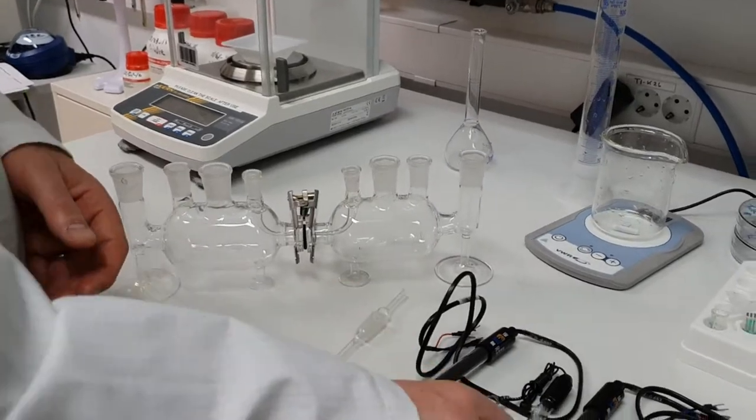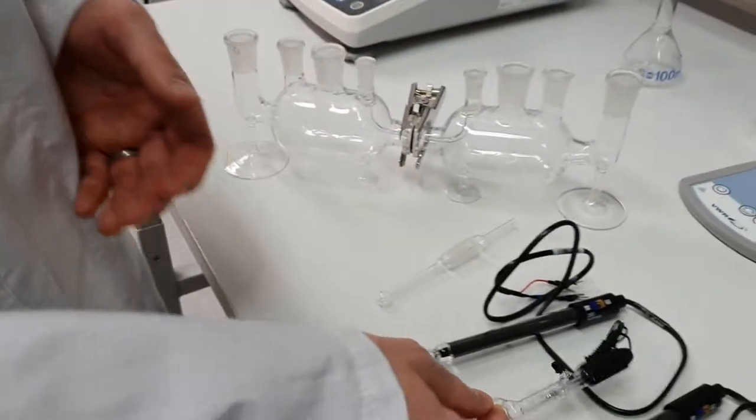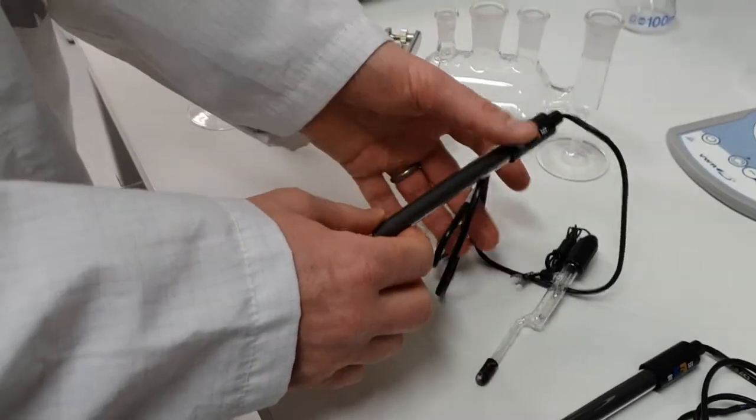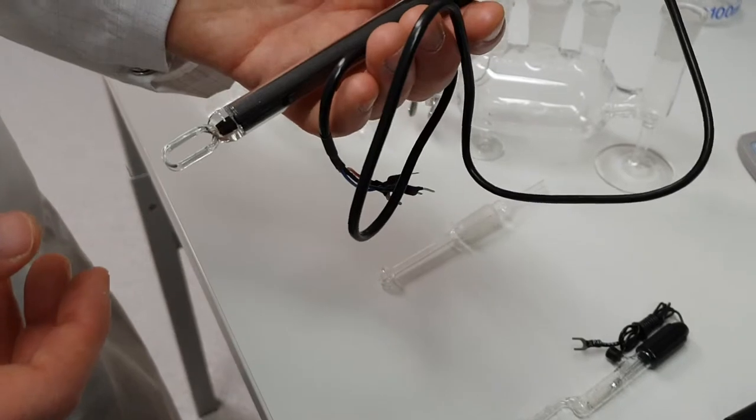The cell comes with a silver silver chloride reference electrode and it also comes with two conductivity probes. So these are two platinum conductivity probes.